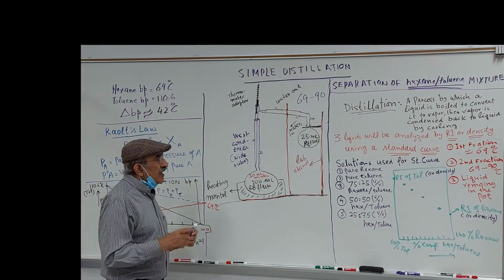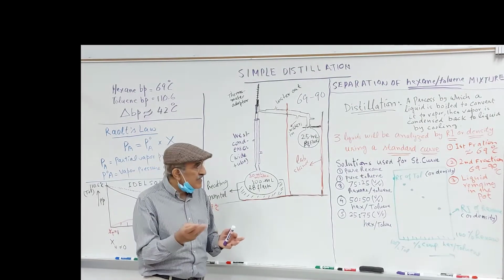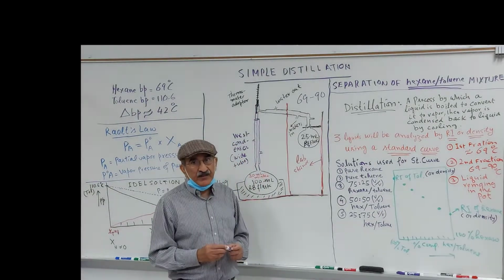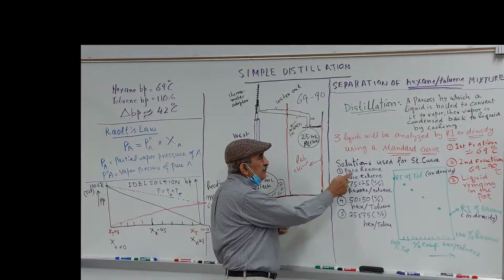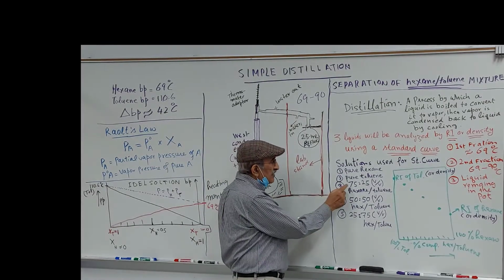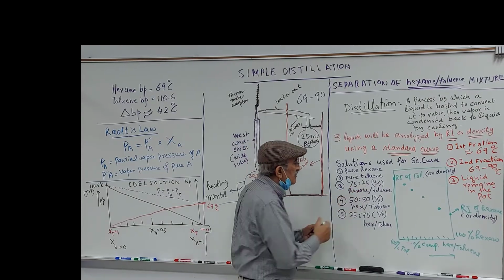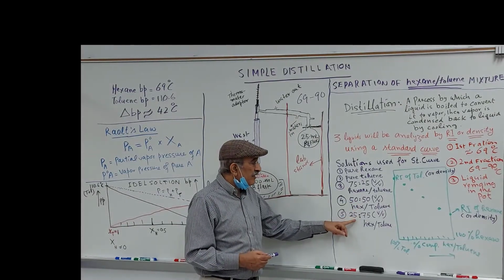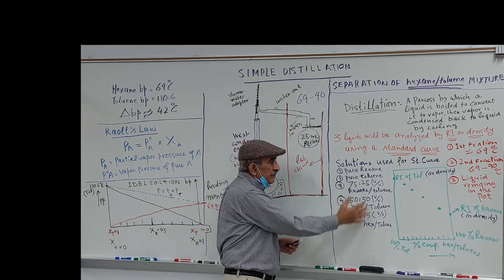All right, so now you want to find out what's the percentage. You have found the density, you have found the RI, refractive index. Basically, you will be given 5 solutions in the lab. The instructor will prepare them for you. First is pure hexane. Second is pure toluene. And the mixtures that the instructor will make: 75% hexane, 25% toluene, volume by volume. Similarly, 50-50 and 25 to 75. So these are known compositions.